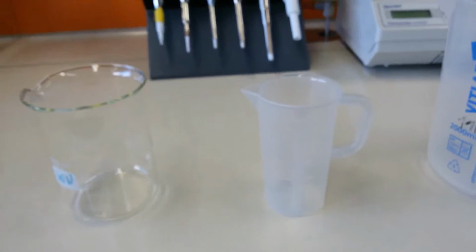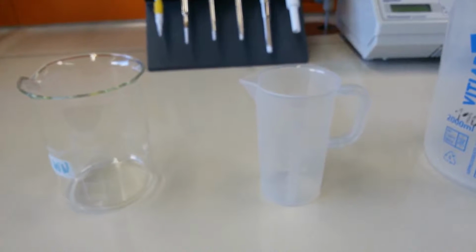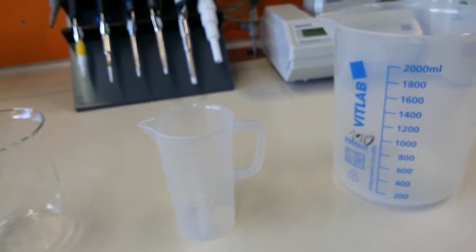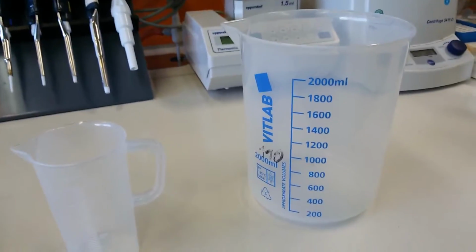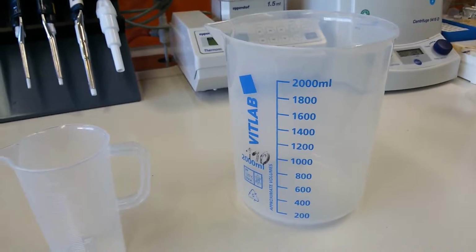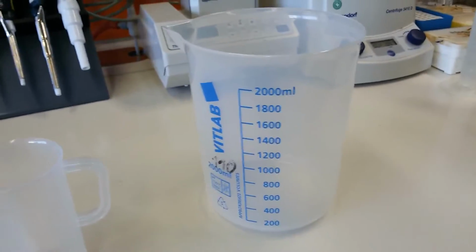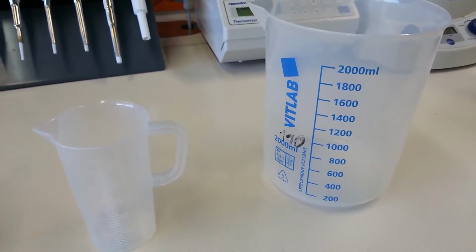These can also be used to measure volume, but they are less accurate than the measuring cylinder, and they only give you a rough estimation of volume. Beakers can be used to measure a large amount of volume, for example you can see here the 2 liter beaker. If you want to prepare 2 liter of media, then you can use this big beaker. The media is like, if you want to grow bacteria, you have to prepare the culture media. So we can prepare those culture media in these beakers. Great. And then I will introduce you to the next set of lab utilities.